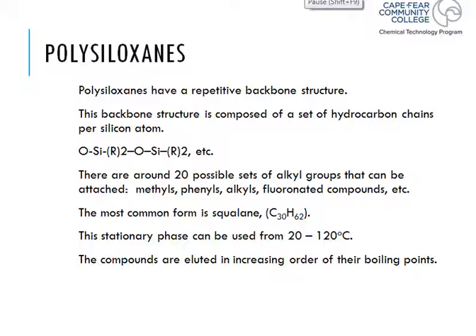Okay, so we talked about the two forms of stationary phases inside of a capillary column. That's the thing that you've got to remember. We're talking about capillary columns here, not packed columns. Packed columns are packed with Chromosorb. They are packed with different material.